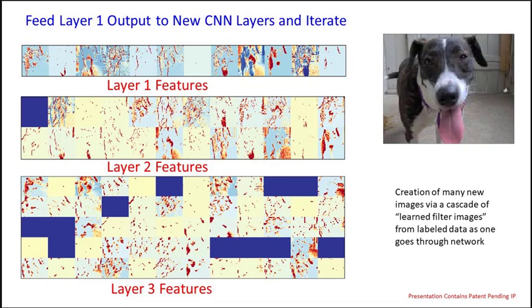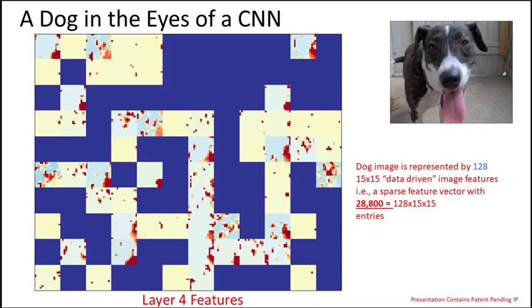This means that in the layer above, there was no match for the particular kernel that was applied, so it's basically a 0 dot product. And as you go further and further in the neural network, more of these 0 pattern activation images show up as a kind of sparsity pattern. That's a common trait in simple neural networks.